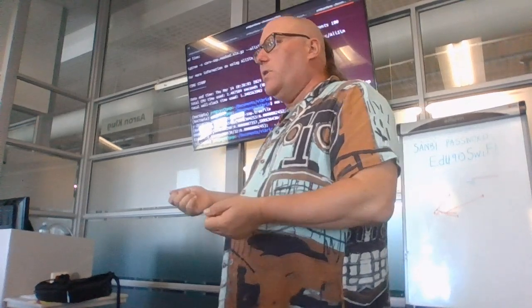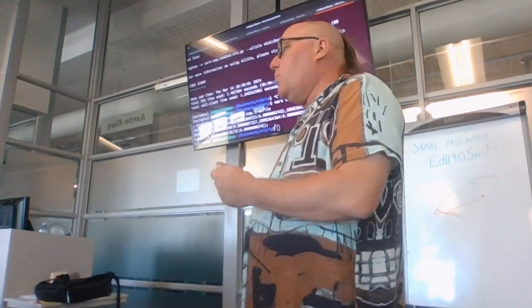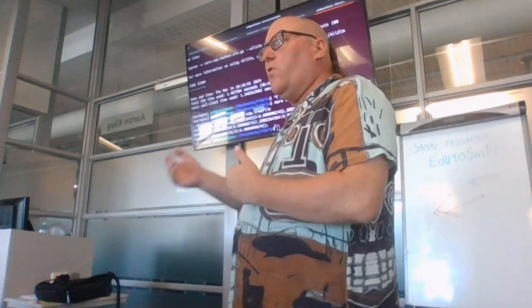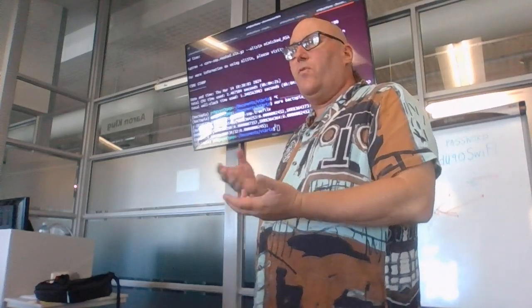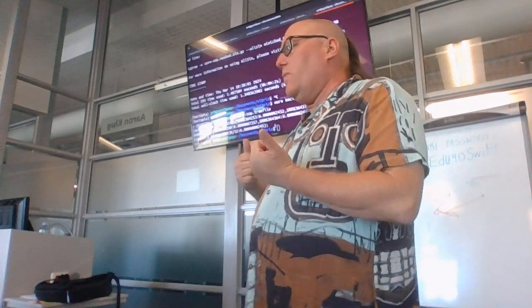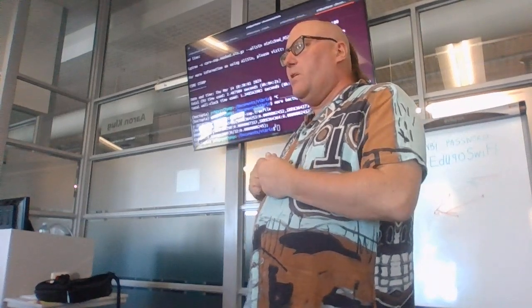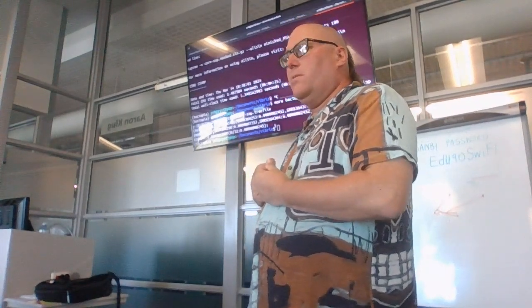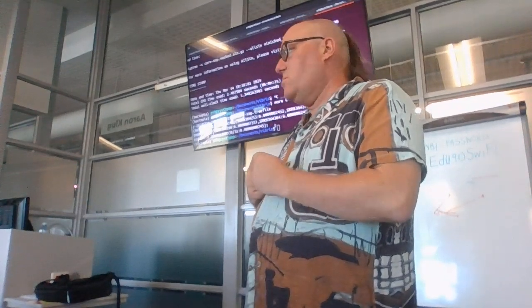I've seen this a lot with Oxford Nanopore, and I'm more familiar with the nanopores than the Illuminas. They get the nanopore sequences, and then the performance is not good. And at least in my experience, but I'm kind of outside of the lab space, there's not enough support to help people understand how to get better performance out of the equipment. I've heard a lot of complaints in that direction.